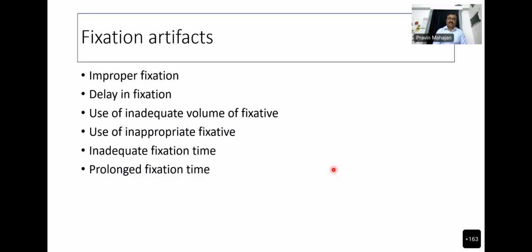Even if the fixation goes beyond 72 hours, there are many artifacts produced in the tissues, and it is not an ideal situation. So prolonged fixation is also not good.